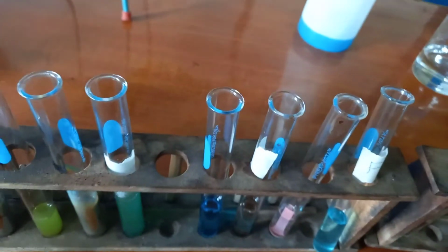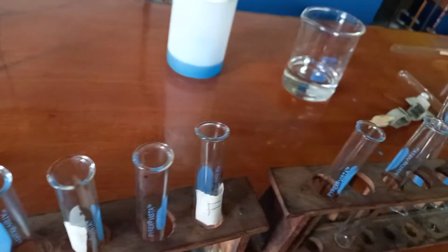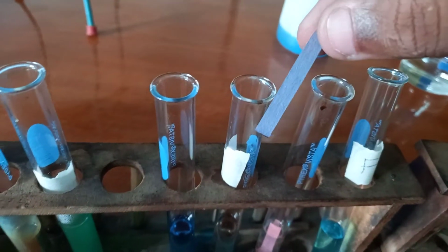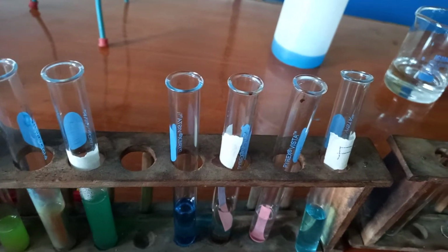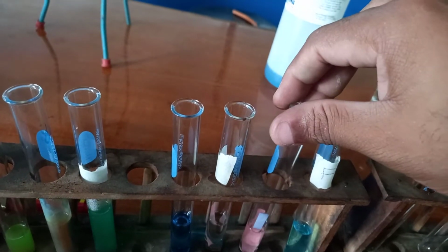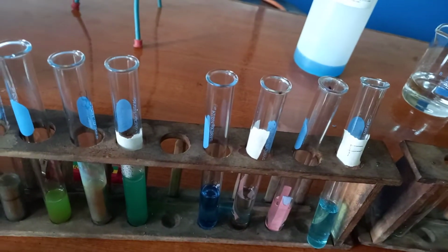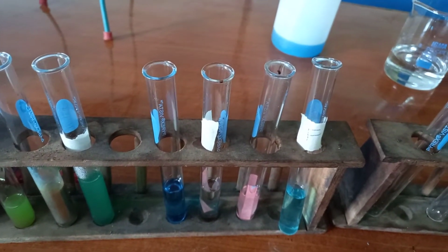So here's the blue litmus paper. And it has changed to red. So we know it's an acid. The same thing I'm going to do again. It has changed to red. So the aldehyde has been oxidized to the carboxylic acid. So I'm going to do a next reaction.